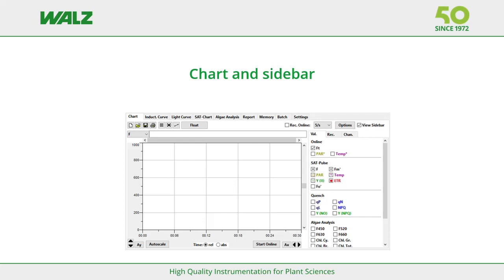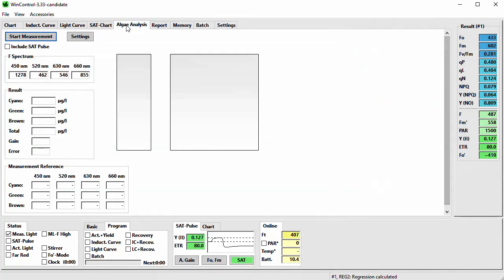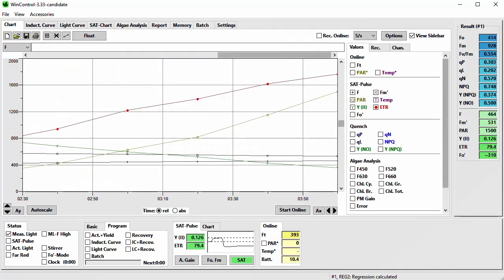Now I come to the center of WinControl 3 — the various tabs and their sidebars. The tabs chart, induction curve, light curve, sat chart, report, memory, batch, and settings are about the same as with other WinControl 3 operated instruments. The algae analysis is a WaterPump 2 specific tab. I start with the chart tab.